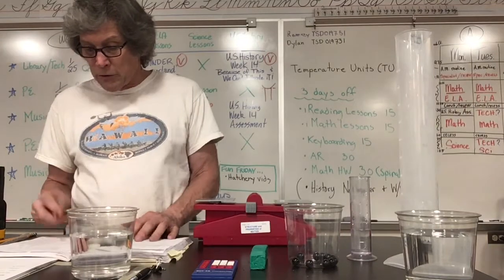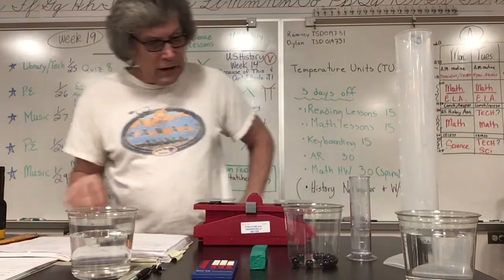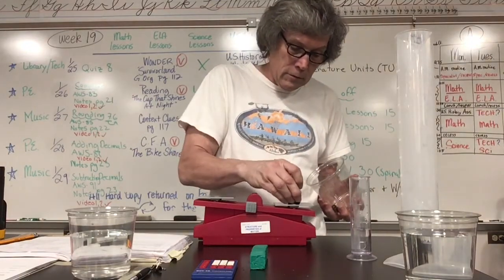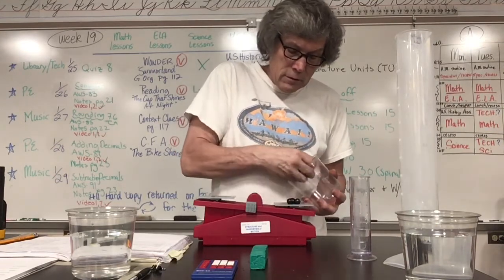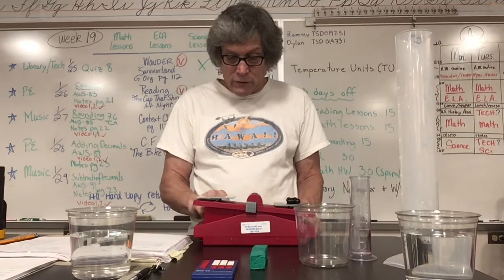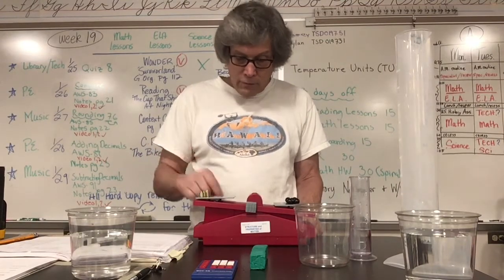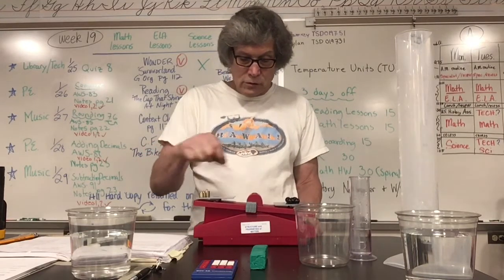Okay, now the marbles. Okay, marbles, I guess I'll cheat this time. I'm just going to put them in. I normally do the same thing where I would weigh this and subtract it, but hey, if I can get away with it this way, I'm going to. Ooh, way too heavy. Let's try a 20. Yeah. 30, 40, 45. Ooh, 45 is too much.